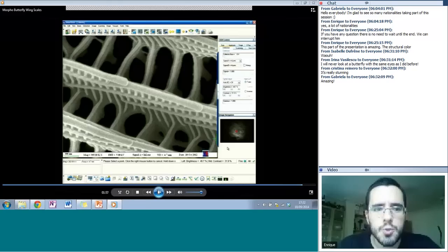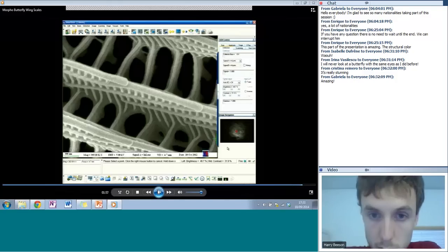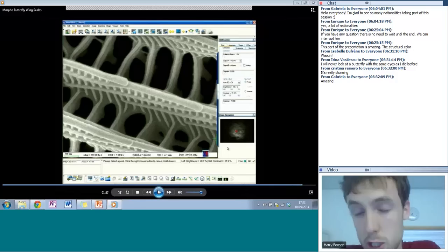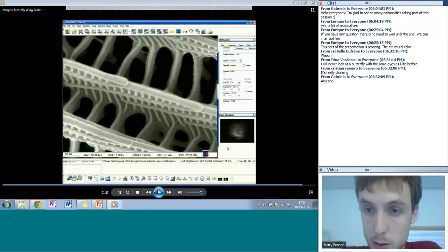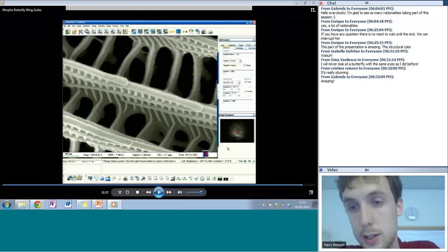I mean, you use this electron microscope from the computer, right? So you don't have binoculars just to see how the wing is. Yeah, to actually use the microscope, what you're looking at here is just a screenshot of the computer screen that we look at. So obviously, it's taken up mostly by the image itself. Then you're controlling things that are essentially shaping the beam. So that's the magnets that control the shape of the beam to get that really small spot size and focus the beam onto the sample. You can also control the accelerating voltage, so the energy of the beam.